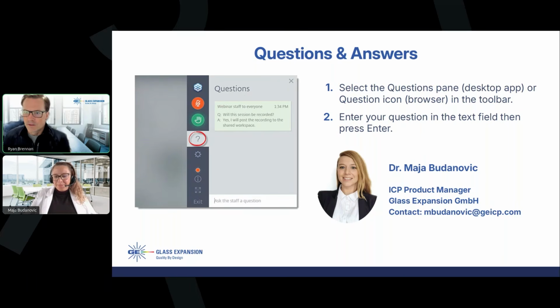Yeah. All right, so it looks like we have time for one last question here. This person asks whether the quality of the argon will affect the results of their analysis, and what are the main causes for the plasma impedance exceeding the working range?